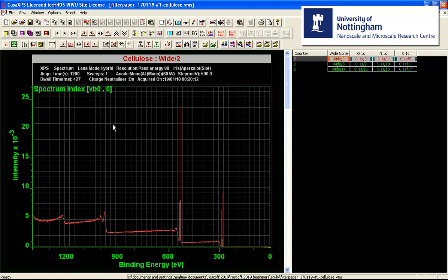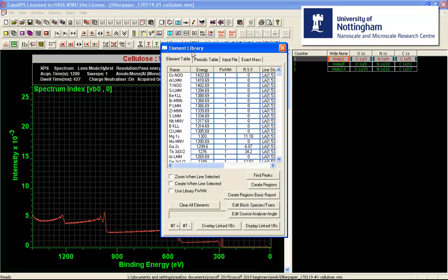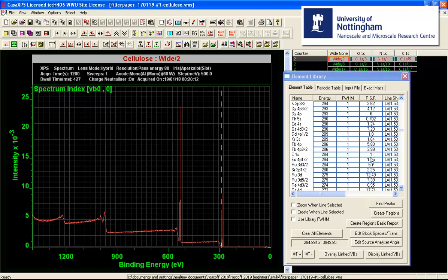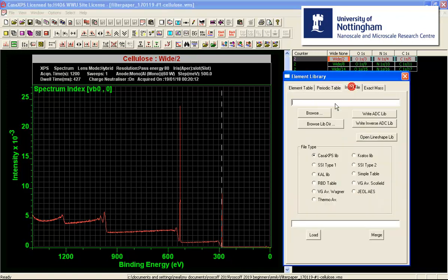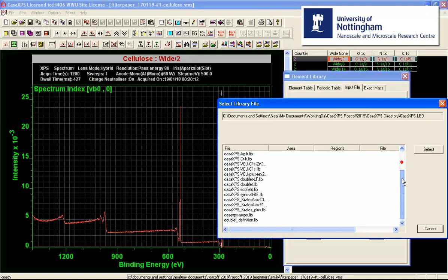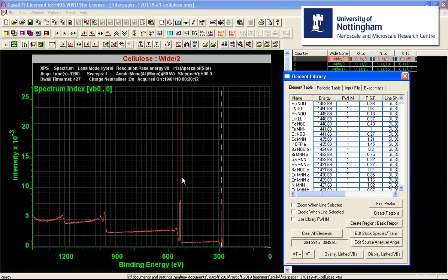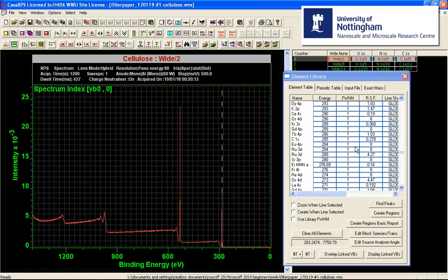Returning to the spectrum, we look at the element library as it currently stands — it has cross sections corresponding to Schofield for aluminium. What we need to do is load an element library appropriate for these data: Kratos sensitivity factors relative to the fluorine 1s. Selecting and loading this library, we can click on the carbon 1s and see a value relative to fluorine 1s, hence carbon 1s has a value other than unity. These are the total sensitivity factors appropriate for the standard instrument.